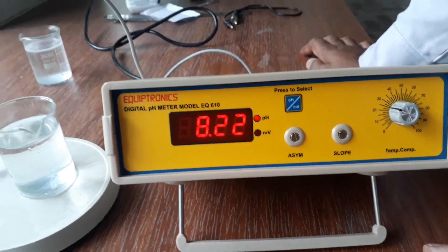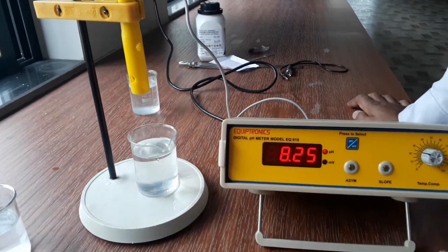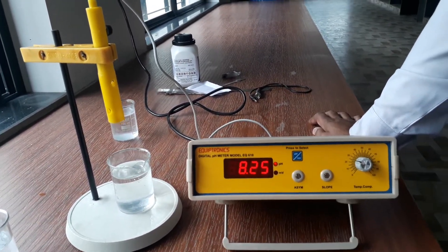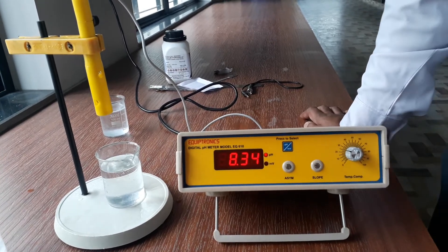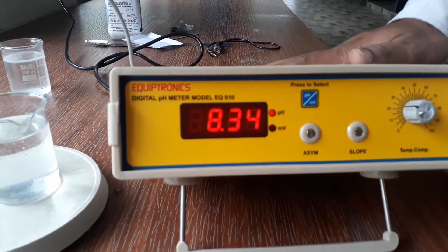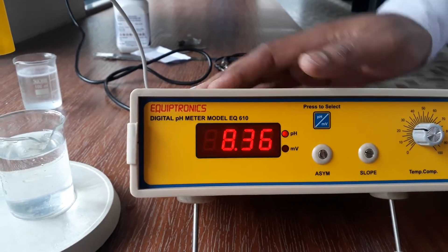It is better than pH paper and universal indicator because it is giving the exact reading in this digital meter. Now here are parts of pH meter and how to calibrate this. This is not in your syllabus so directly we will see how to use this pH meter for taking readings.